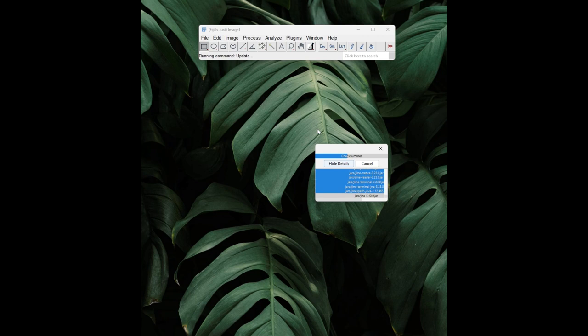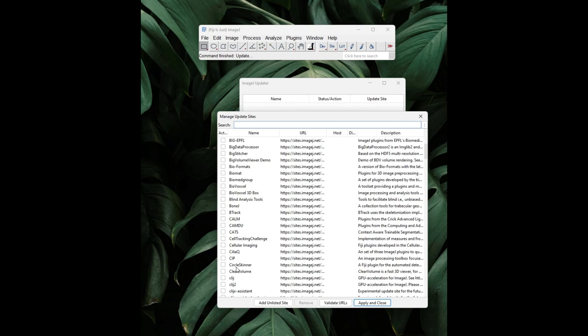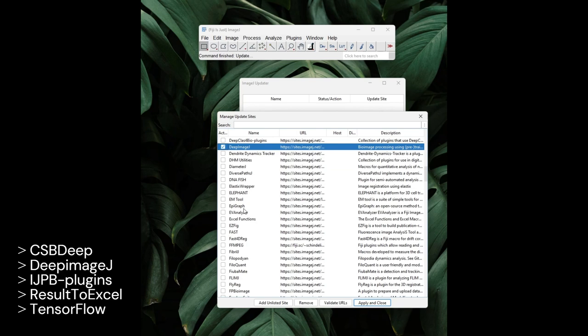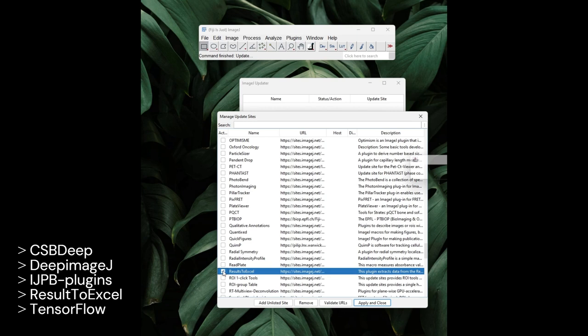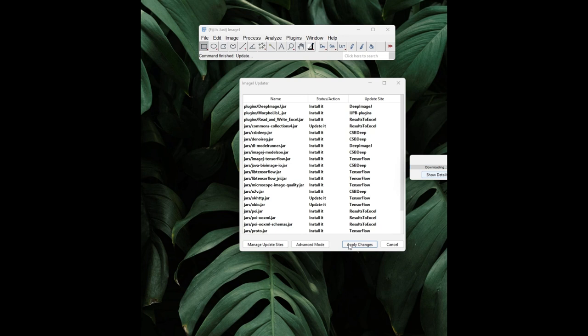You will need to update the Manage Sites. So you select the following domains and update the new versions: CSBDeep, DeepImageJ, and the IJPB plugin, and Results to Excel as well. And finally, you need also TensorFlow. You click on Add to Update Sites, then you close and apply the changes. You wait for Fiji to download all the necessary packages and then you restart Fiji.